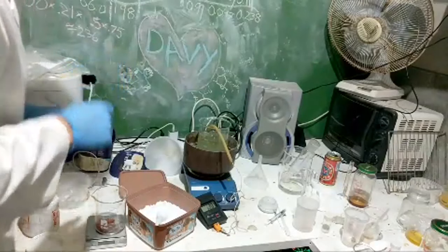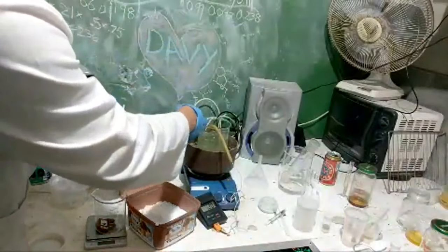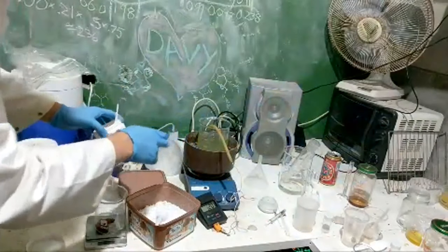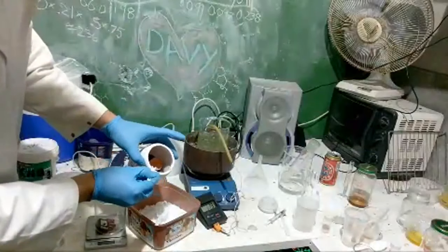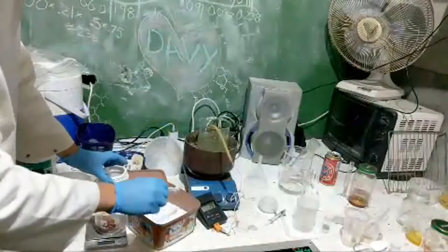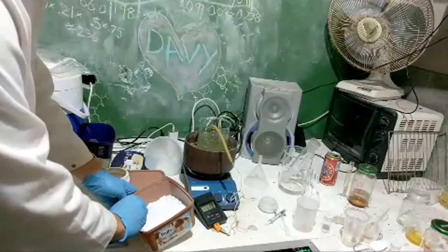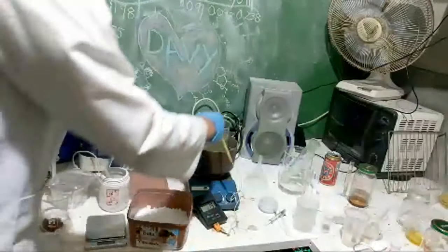What's this reaction use? That's what I like about this reaction, actually. We're using household bleach, reasonably high strength, somewhere between 8 and 12%, I'd say, these days. Iron oxide, which I made from electrolysis. This is red iron oxide. I'm not sure you can see that, but it's quite good. And potassium hydroxide that we're just using to make the solution more basic. We could probably use sodium hydroxide for sure, but I'm just using potassium hydroxide because I can.